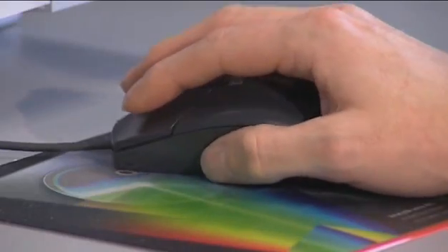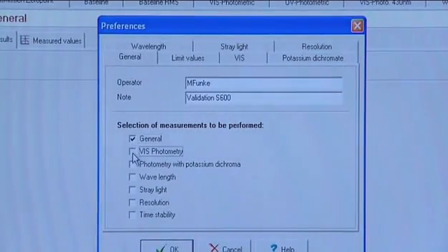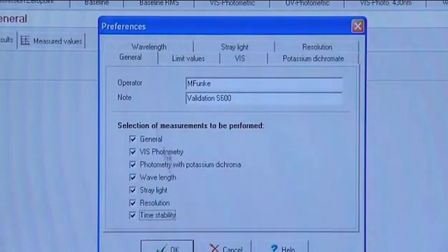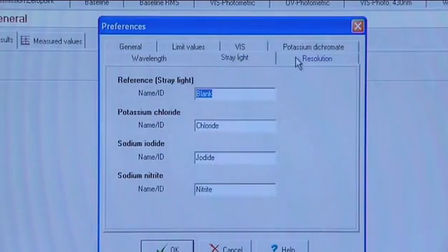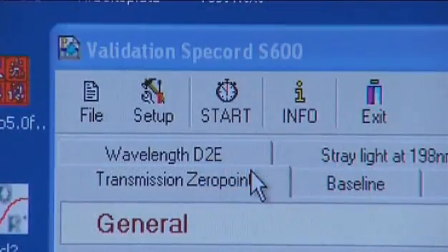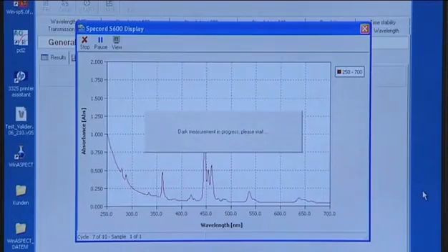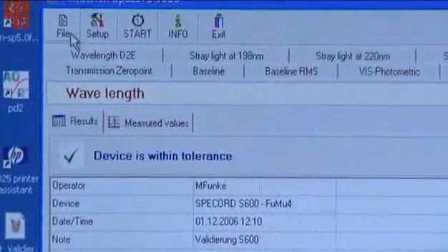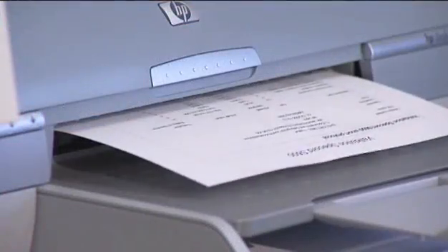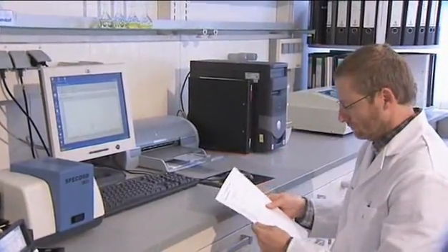With its excellent optical attributes, the Specord S600 satisfies all demands of international pharmacopoeia. The therein required parameters — like photometric precision in UV and VIS range, wavelength accuracy, wavelength reproducibility, stray light and spectral resolution — can be verified by means of a validation set. You decide whether to perform the device validation yourself or have it done by qualified experts of Analytik Jena under conditions of an IQ/OQ.